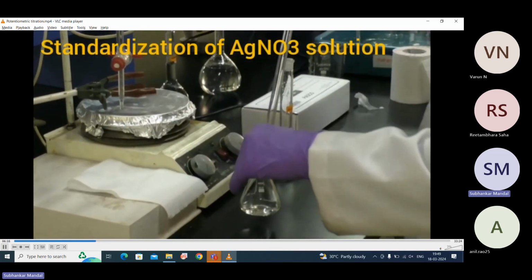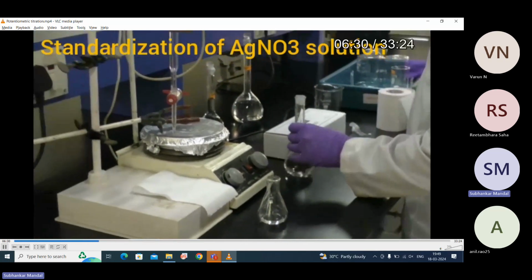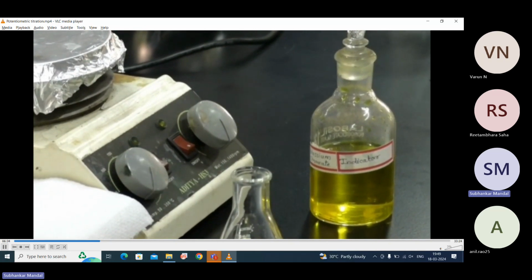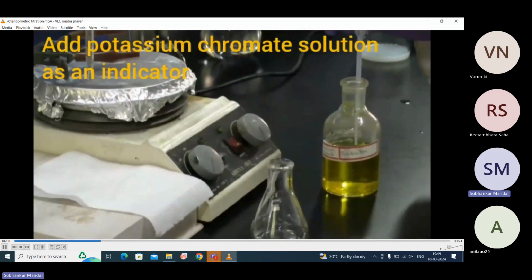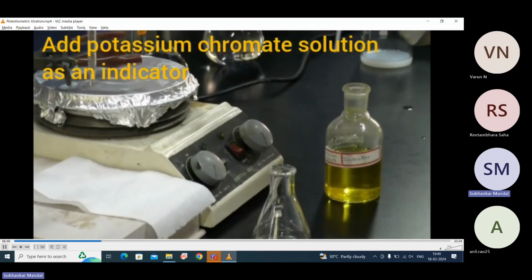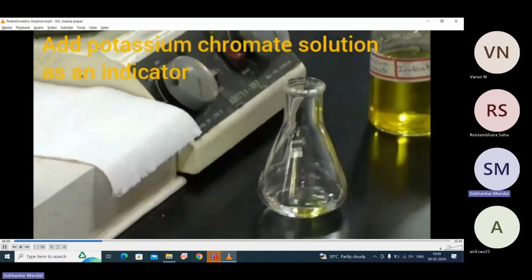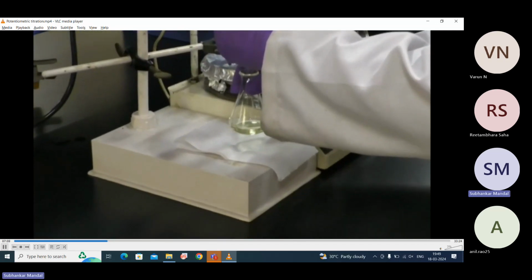We have taken 10 ml of NaCl solution, and we are using potassium chromate solution as an indicator. We have added 1-2 drops of potassium chromate. Now we can titrate.